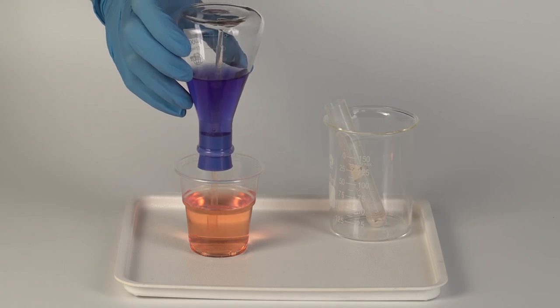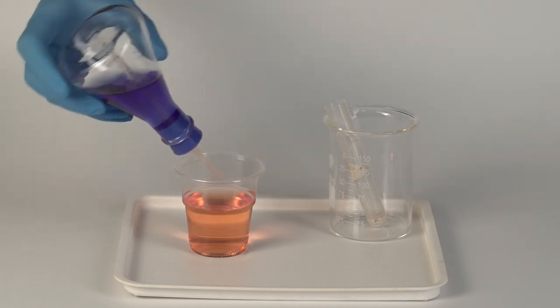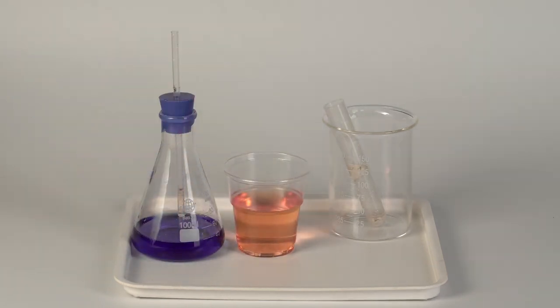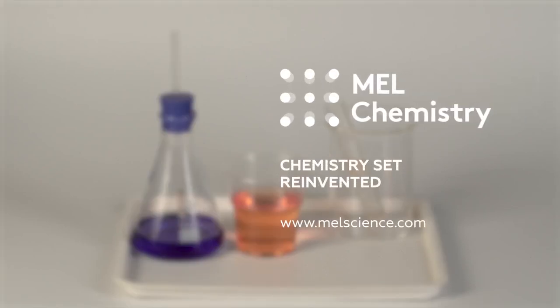To dispose of the reaction mixture, fill the test tube with water. This experiment is a bit of a challenge and might seem somewhat complicated. If you have any difficulties with it, try to perform the experiment using the instructions that we have sent you via email. Learn more about this experiment on our MEL Science website.